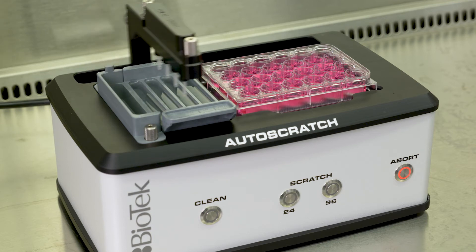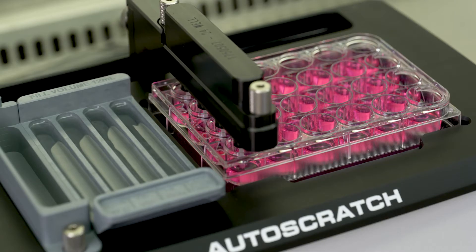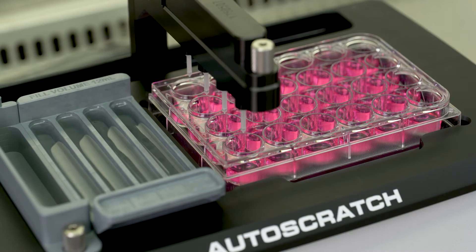As a better alternative, Biotech has created the auto scratch wound making tool. It automatically creates reproducible uniform scratch wounds and enables robust cell migration analysis.